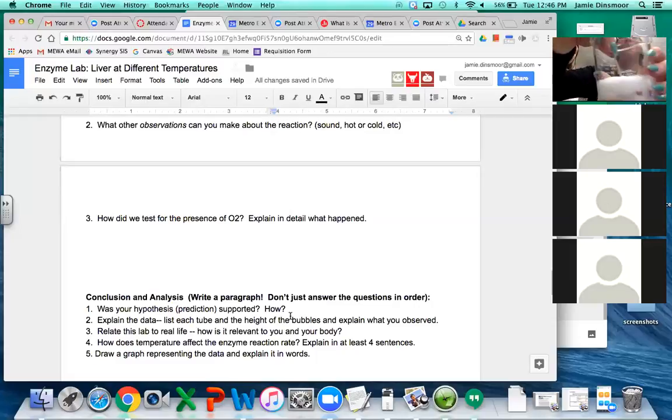Come on. Oh no, it's going to burn out before there's enough oxygen. Burns out. I made a little popping noise. I was like, didn't get it. Oops. It's hard to not touch the bubbles.